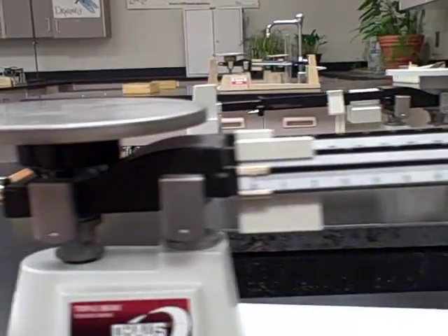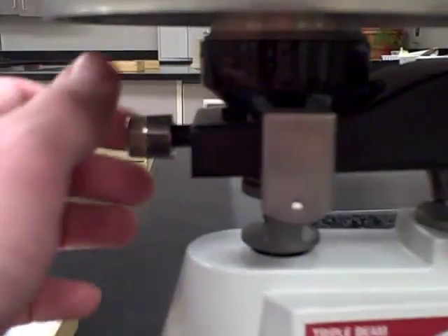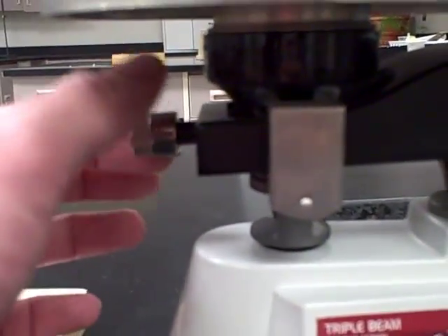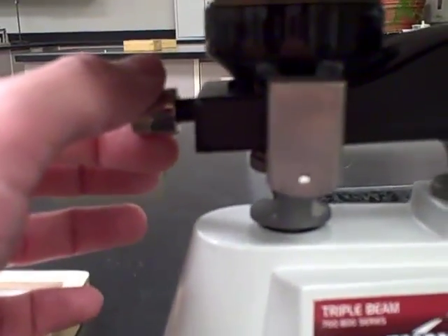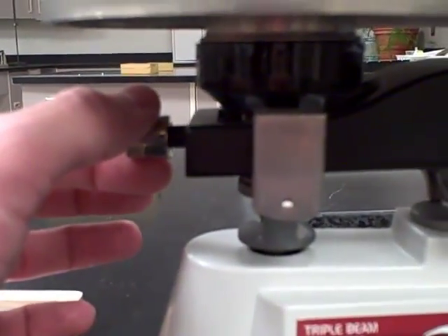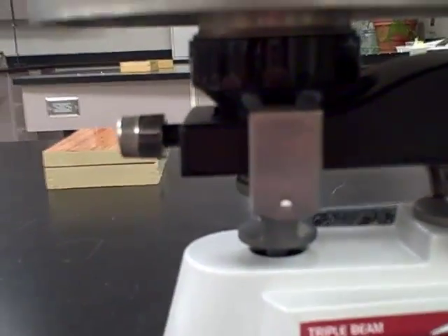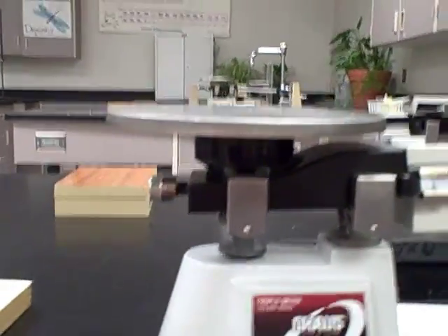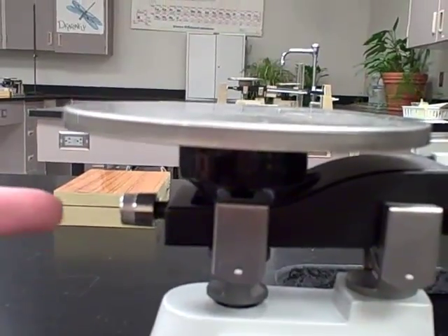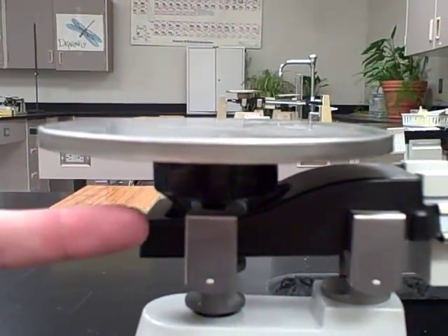The calibration knob is right over here on the left side of the balance underneath the pan. You can just rotate it one way or the other. If you rotate to the right, it's going to go in this way and shift some weight in that direction.